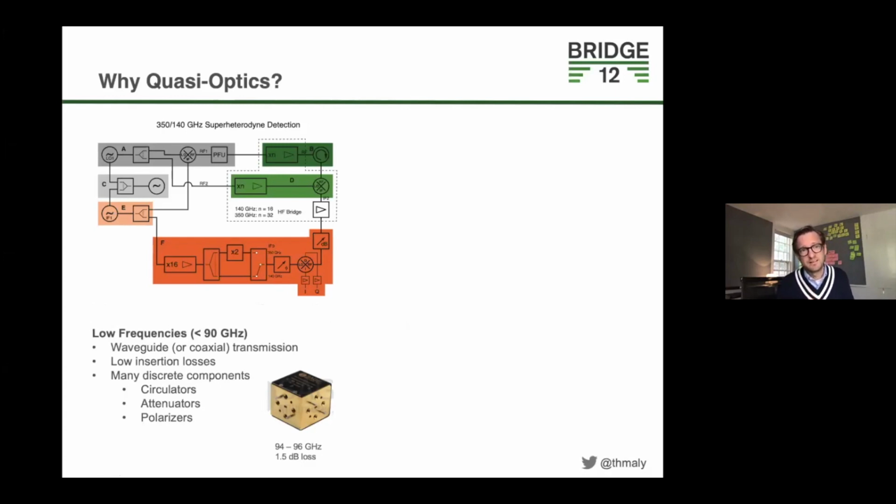The reason for that is, if you look at this, a little bit more sophisticated scheme of a dual frequency EPR spectrometer. This device here is something you can buy for low frequencies, available as a discrete microwave component. That's a circulator. Again, whatever comes in here is thrown out here, what goes in here is thrown out here, and what goes in here is either directed to a load or back here. This is readily available at 95 gigahertz.